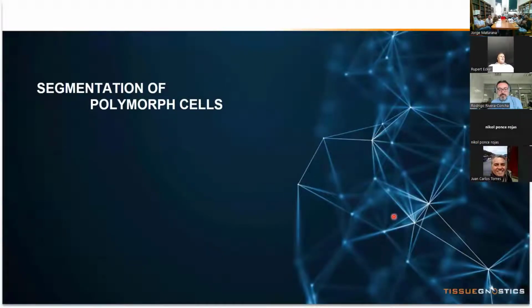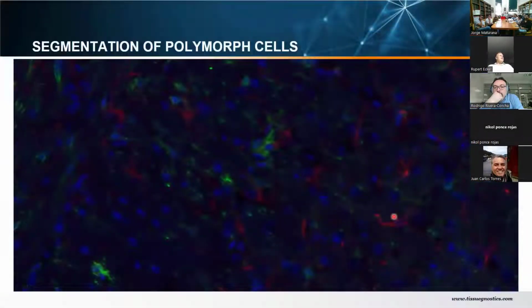These were both examples of single cells which were more or less round. I mean, the nuclei with Ki67 were very much round. The tissue infiltrating leukocytes are still quite round, but there are also cases where the cells are not round at all. And here we see an example.